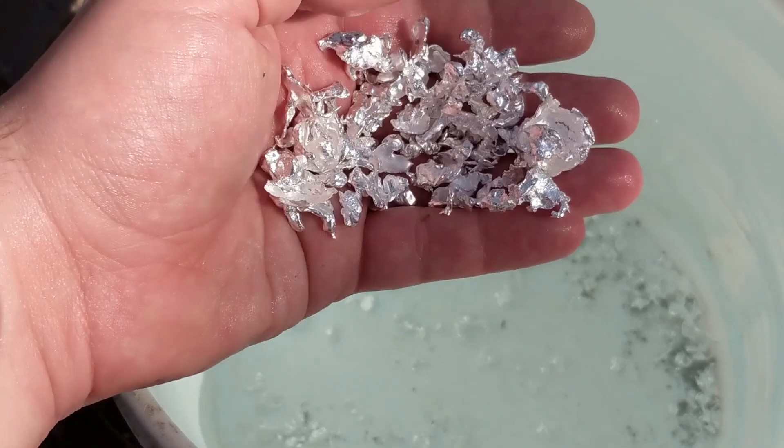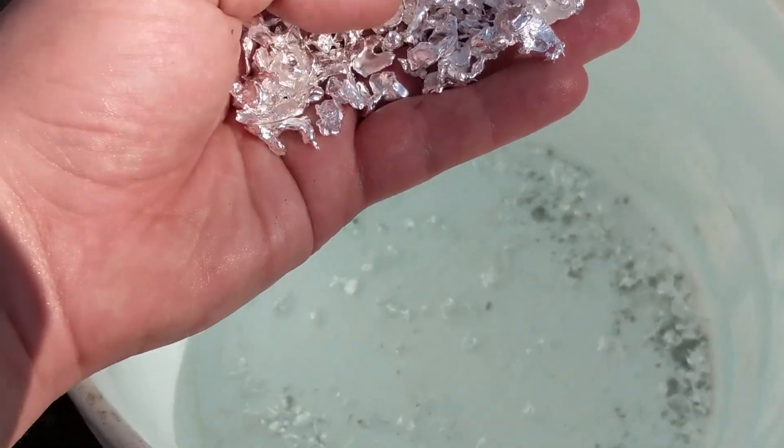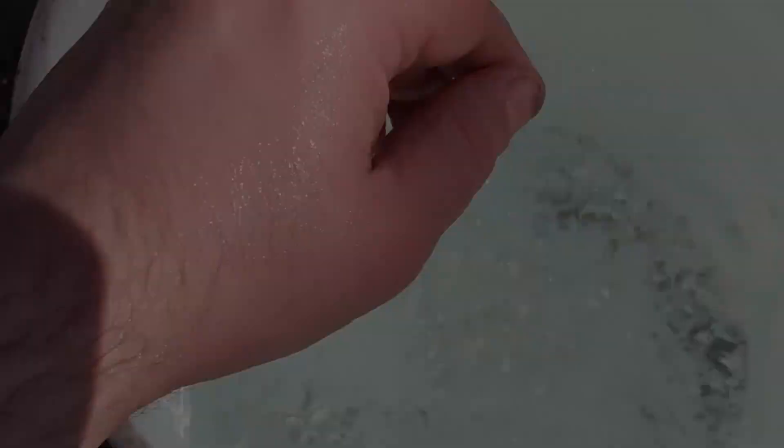Well, this was just a quick video to show you what I did with the leftover silver and solution from growing the crystals, and show you a good way to make water shot.